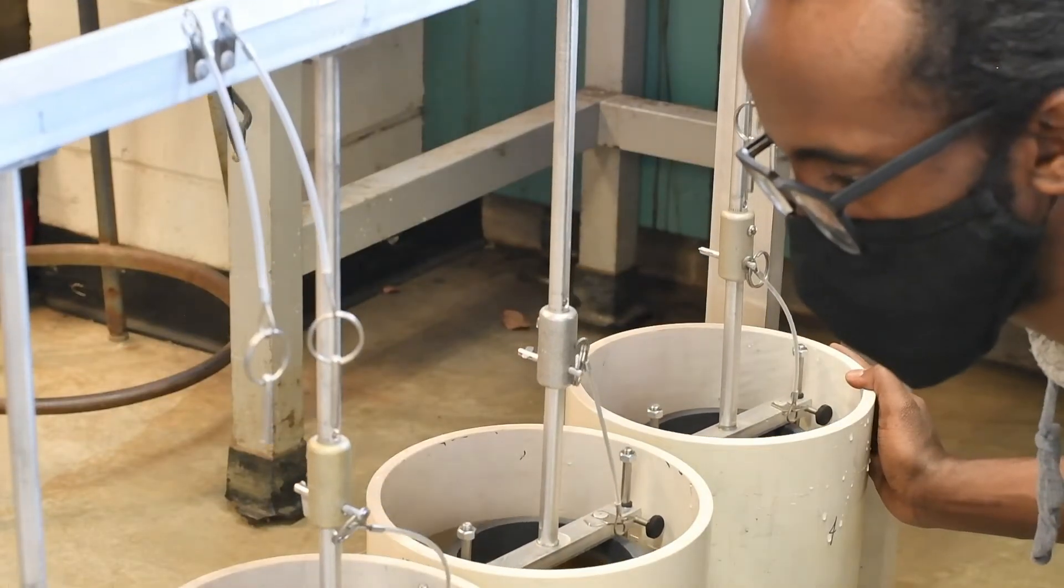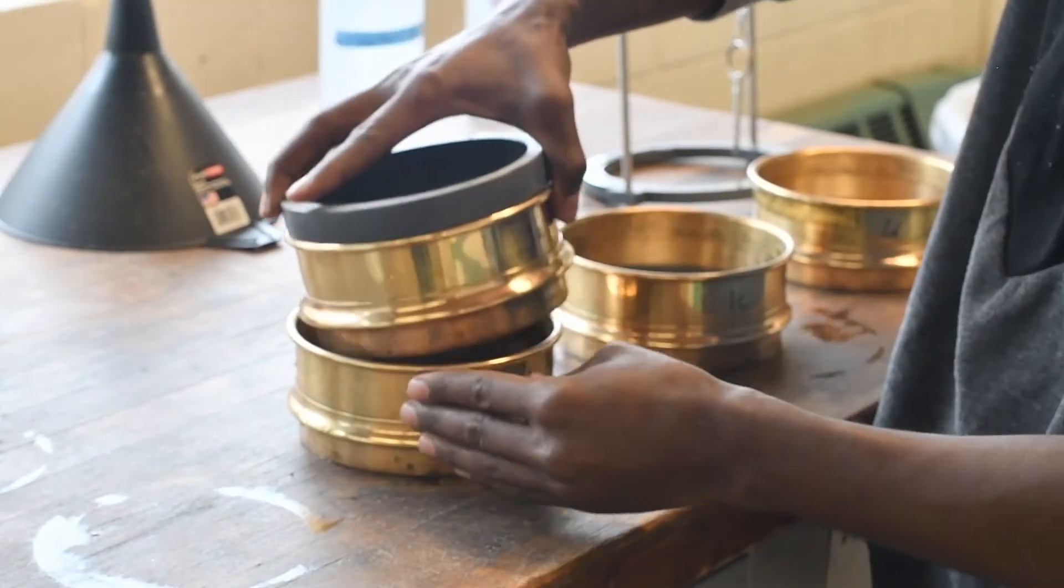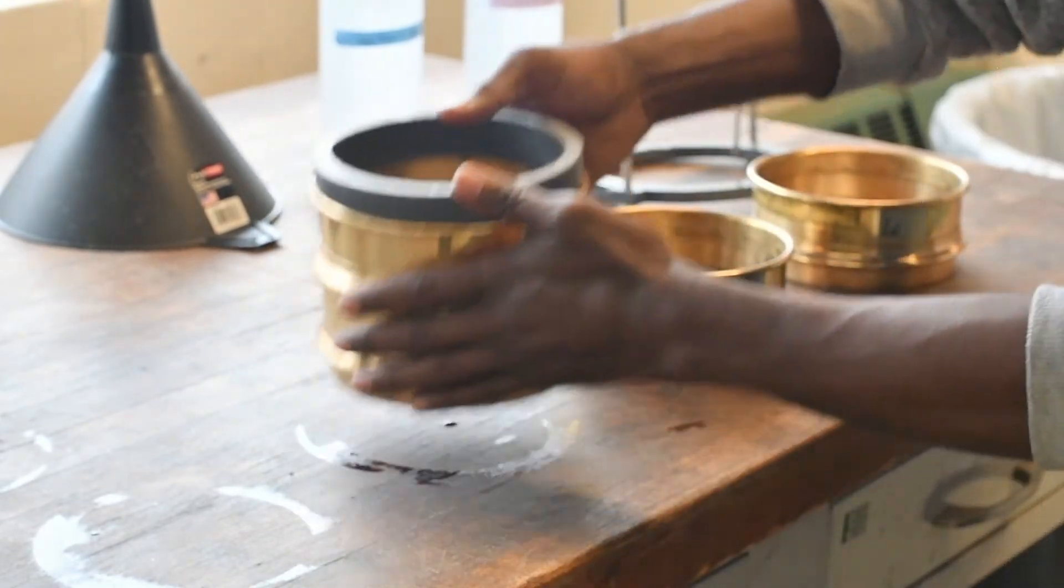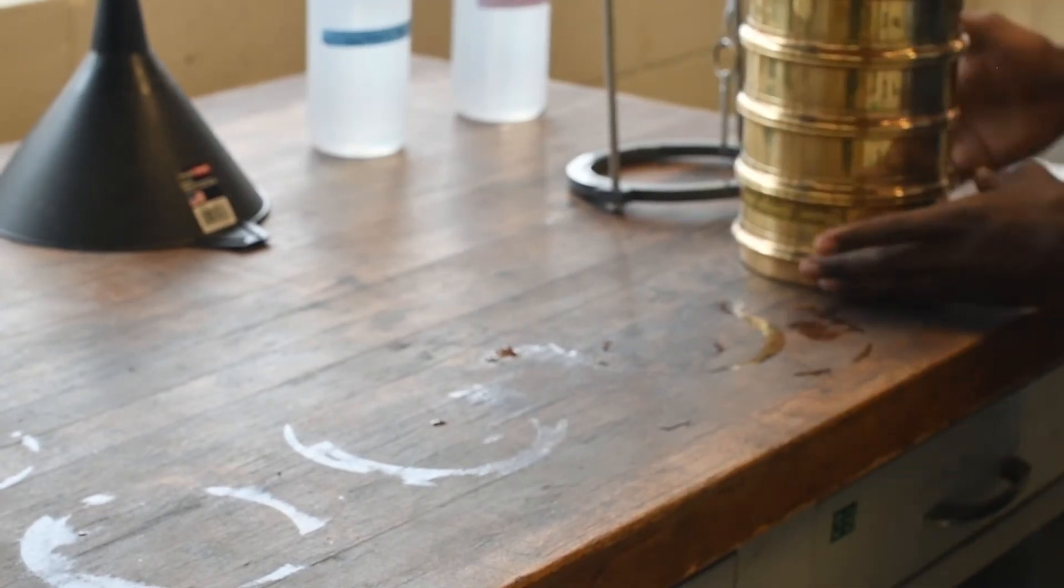Then you take that dry sample and you subject it to moving water, which mimics a disturbance. As that soil is subjected to that water, that water will rush into the empty pore spaces within the aggregate and the change in pressure can cause that aggregate to break apart or slake into various different sizes. Because we measure our soil samples on a stack of sieves, that means that we can catch and calculate the fractions of soil as they fall into the different sieve sizes. Then we can calculate a single value called mean weight diameter that relates each fraction to its sieve size as a singular measure of aggregate stability.